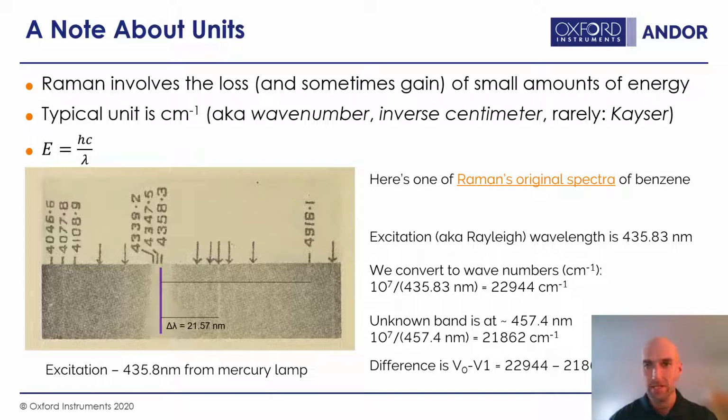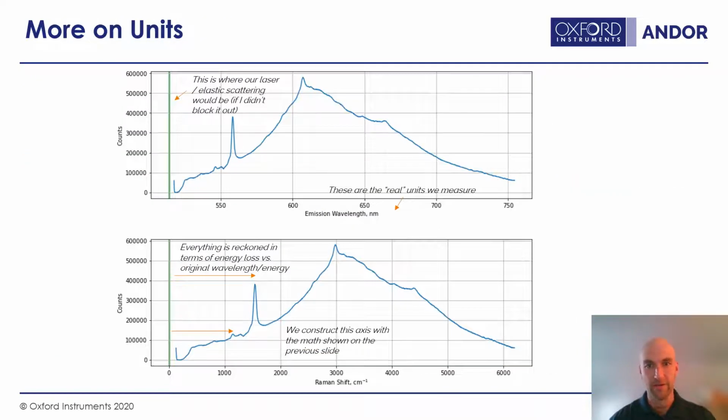Now let's see if I can show this a little bit more clearly on an X and Y spectrum. Those guys did a lot with photographic film, but it can be hard to read the intensities on there unless you're just very good at looking at differences in white contrast. So here's one spectrum. This is a resonant Raman spectrum with some fluorescence left over. So green is where we're exciting, and I've gone through great lengths to block off that laser beam because it's so much stronger than the Raman spectrum that it's creating.